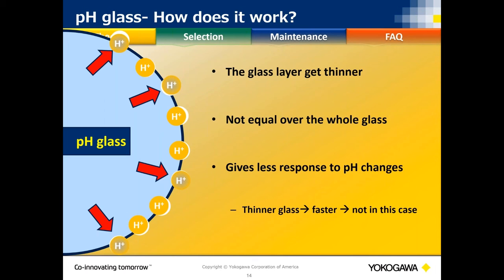Okay, now the guts. Remember how I said temperature is vital? Have you ever noticed how sometimes your temperature goes up, your pH can go down? There are two effects that temperature plays in pH samples, no matter whether it's water or not.